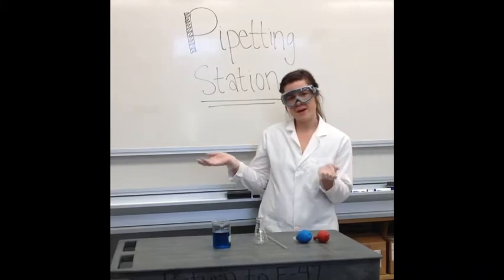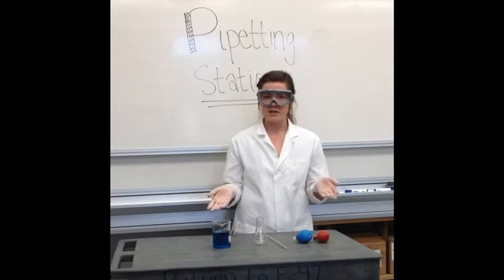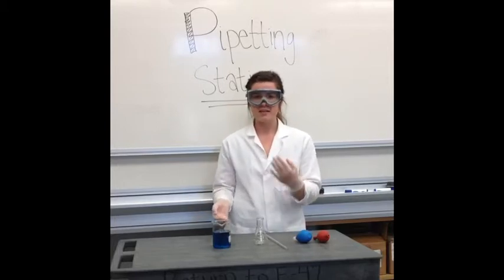Hi, and welcome to the pipetting station. My name is Lacey, and today I'm going to be talking to you about how to accurately measure volumes from one container to another container.